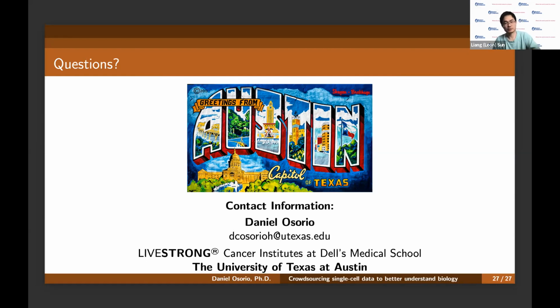So the question is that I'm really glad to hear that you did some study to give us some idea what cutoff we should use for the mitochondrial genes for the single cell RNA-seq analysis. So 5% for the mouse data and 10% for the human data. I was just wondering, do you also find any patterns, say in mouse or in human data, for example cancer samples, where the cells may be more transcriptionally active? So should we give a higher cutoff for the mitochondrial genes?